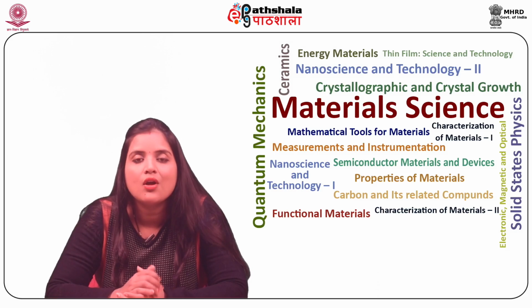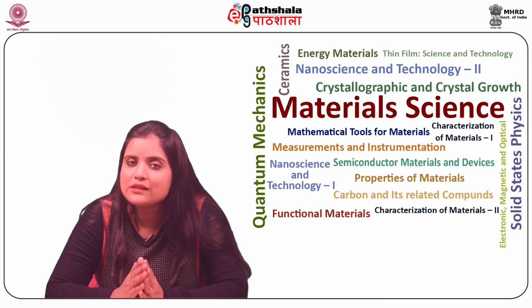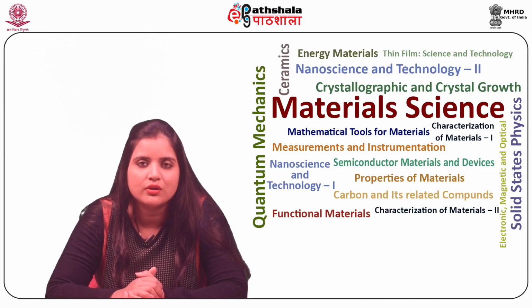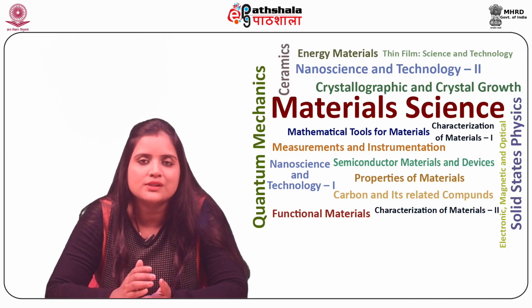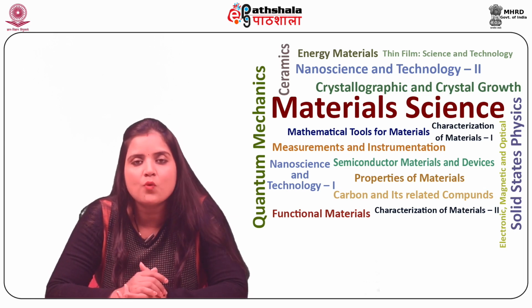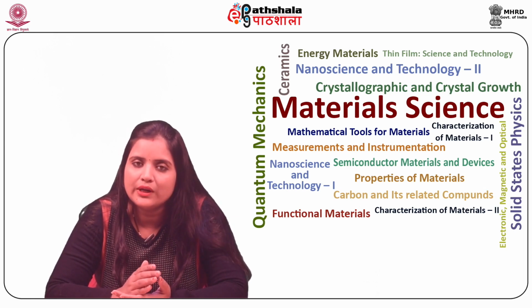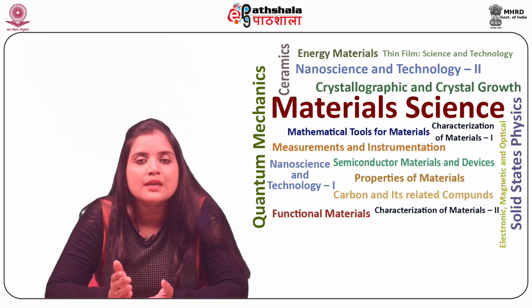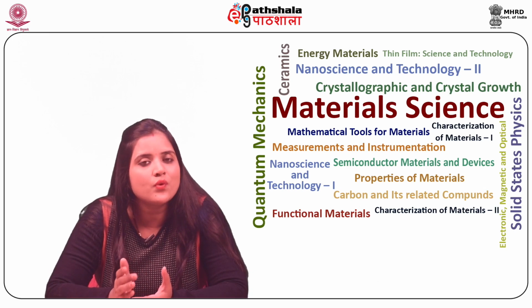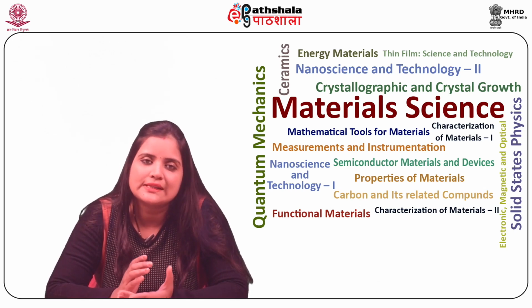So students, let us now summarize what we have learned in this module. The basic components of a scanning probe microscope, that is SPM, were described. The various types of SPM, scanning tunneling microscope and atomic force microscope, were discussed.